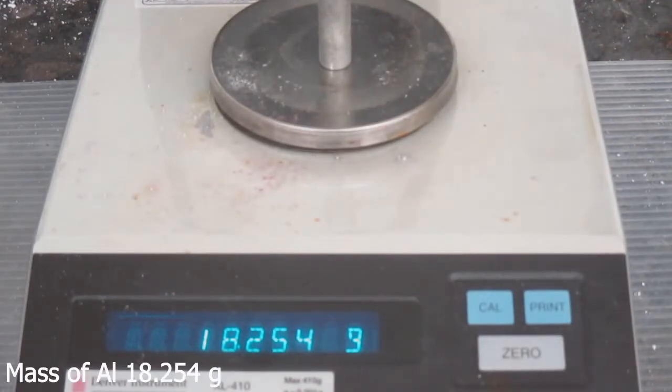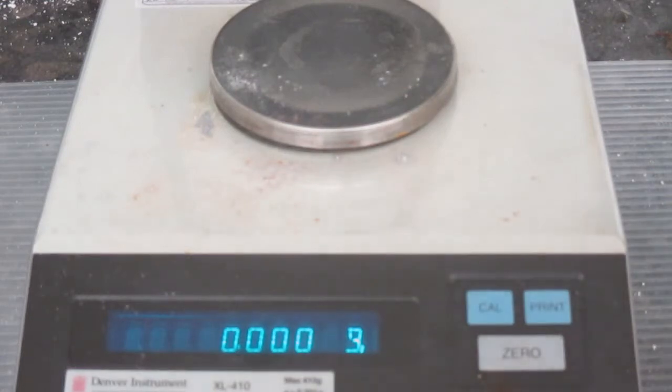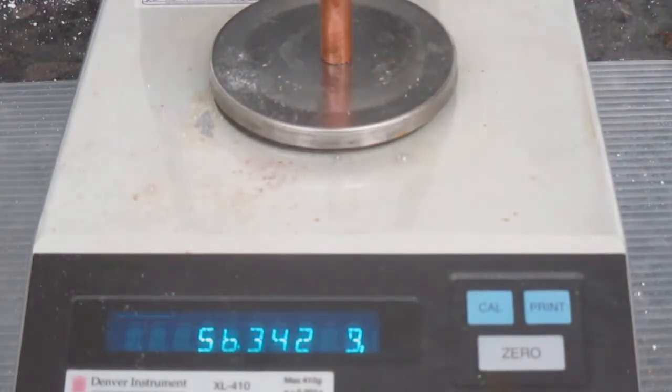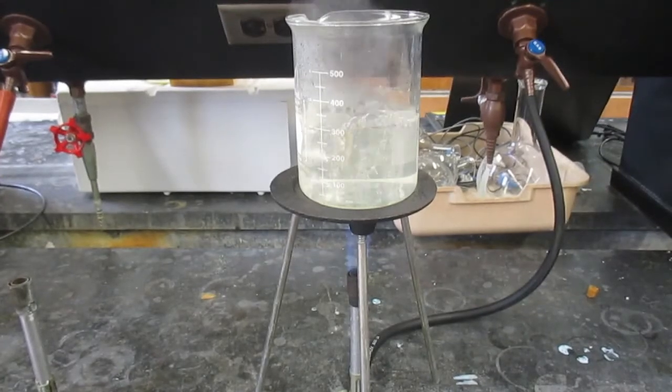The mass of the aluminum cylinder is 18.253 grams. Now I'm going to record the mass of the copper cylinder. The mass of the copper cylinder is 56.342 grams.